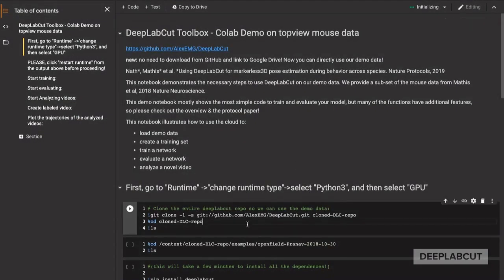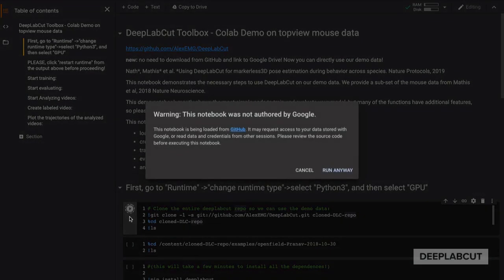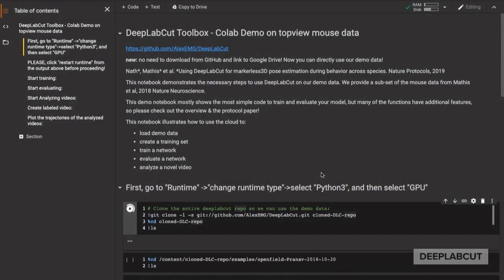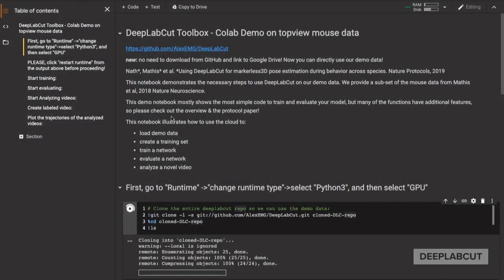What we're going to do is locally install the GitHub repository so that you have access to the demo data.